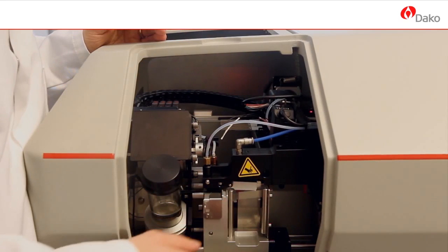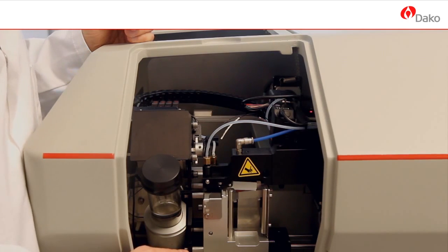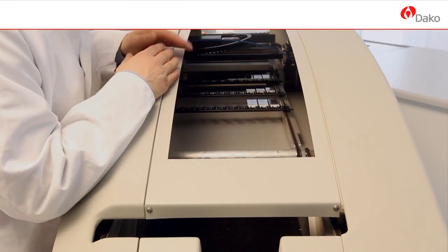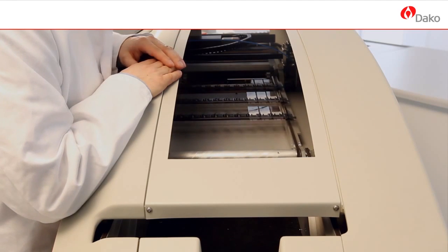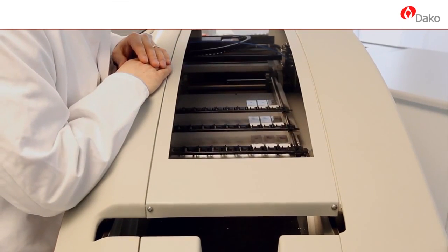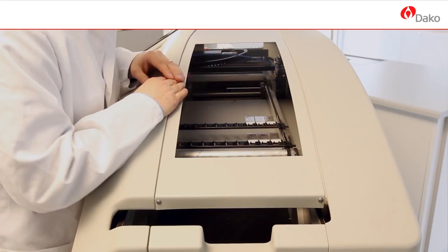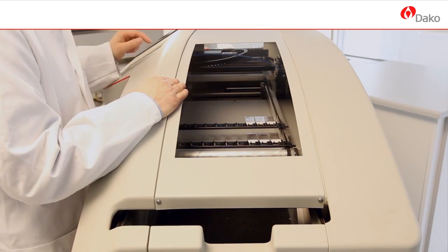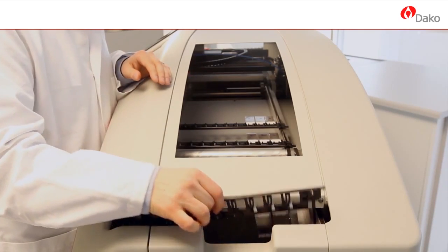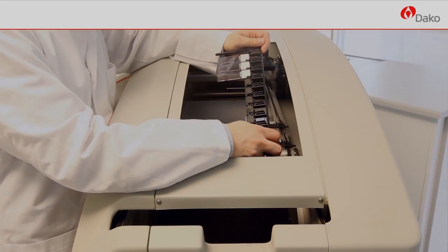When the last slide has been cover slipped, the cover slipper transfers the slide rack to the drying unit, and then the next rack can come up and be cover slipped. The drying unit then dries the slides for 10 minutes. When this is done, they are transferred on the belt out to the exit station. The capacity of the drying unit is 11 racks at the same time. When one rack is finished and ready to be taken out, an alarm sounds, the eject rack button is tapped, and the rack becomes available for the user for microscopic evaluation of the slides.